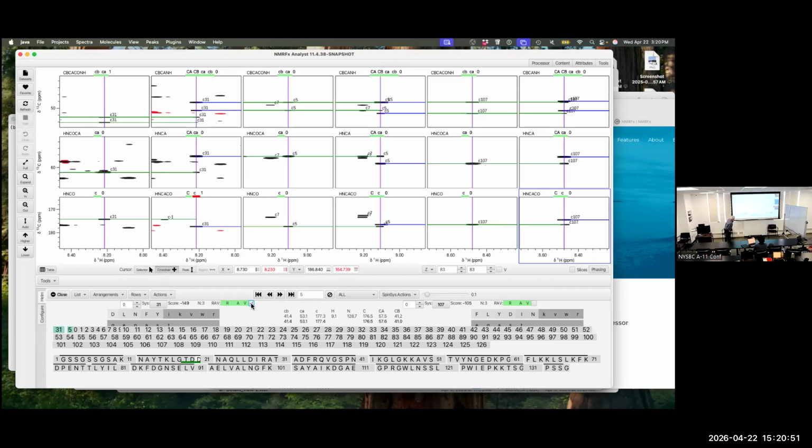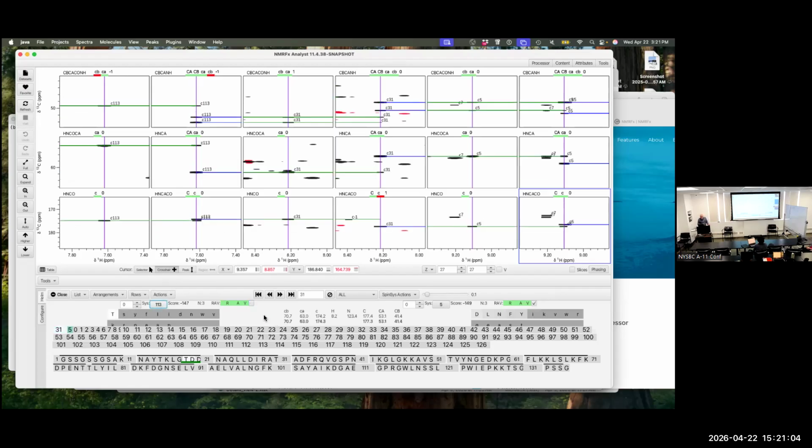And that's kind of a characteristic of the shifts. Right. And then I can click on this previous residue and say, okay, this looks visibly nice. It's got a score here, minus 147. The scoring is now based on a paper from Josh Vaughn, a Bayesian calculation of what chemical shifts ought to be. Basically minus 200, minus 250 for the end.